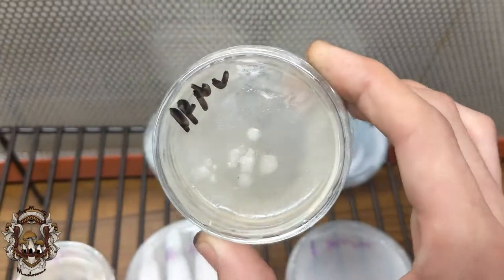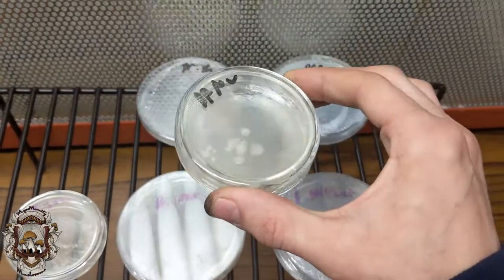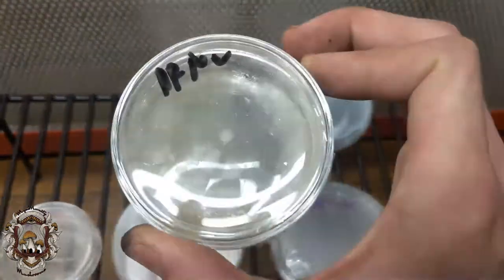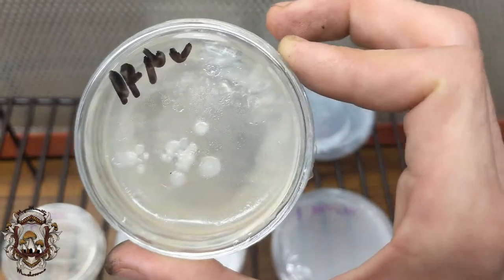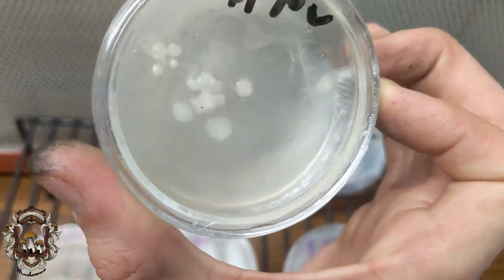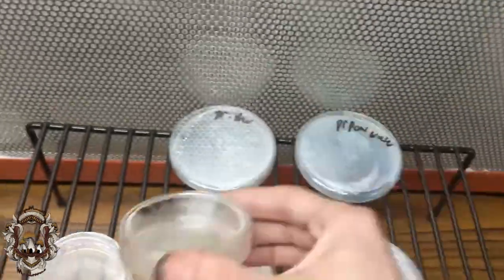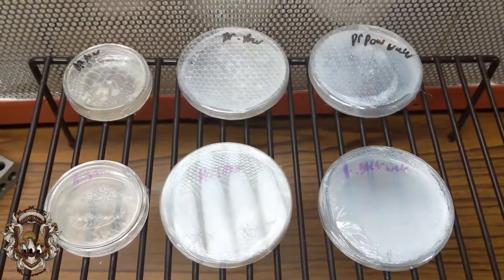So I'm actually going to turn the flow hood on so we can take a closer look at these without the lids. This one specifically had excess water pooling in it, and you can kind of see even just from here there is a layer of bacteria all the way around the perimeter. You can even see a little bit of that moisture still in there. So we're going to take these lids off and give these a closer look. Keep in mind that one's pretty messed up.